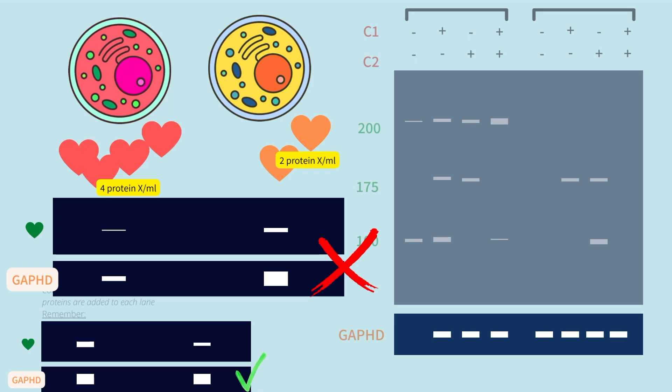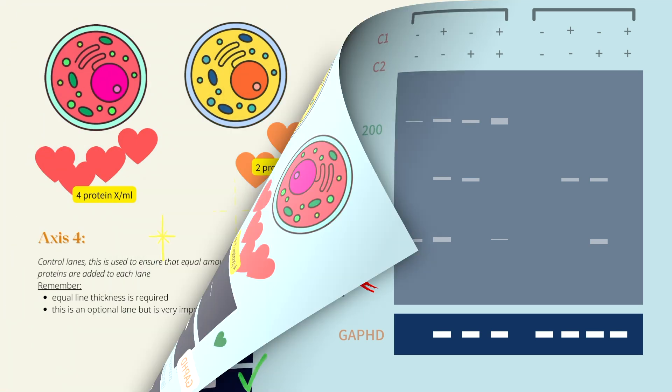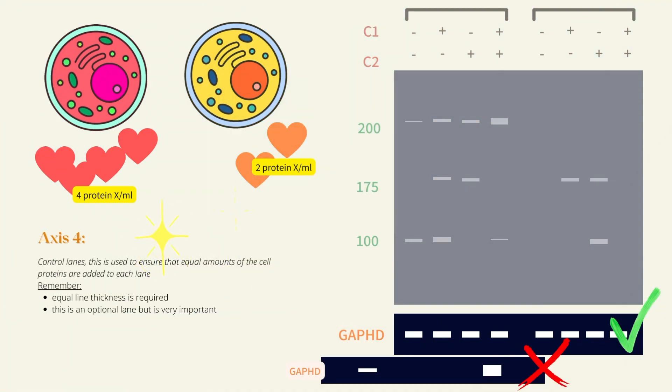When in reality, it's just because the yellow cells had more proteins loaded on the gel. In sum, a good control lane will have equally thick lines. If they're extremely varying in the line thickness, then I would be very skeptical about those results.